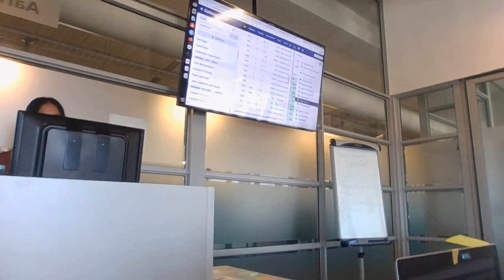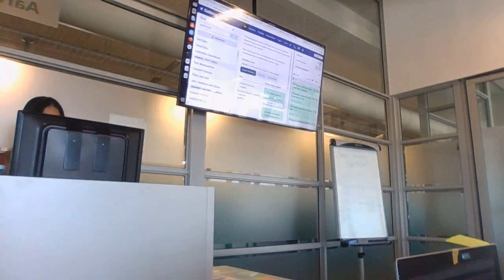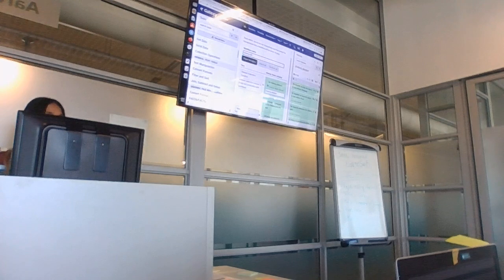So create a workflow is actually extract workflow. You will extract that, and Dafa gave a nice example. She said she's just going to call it QC. Right? You could name it something intuitive, and then click create workflow.